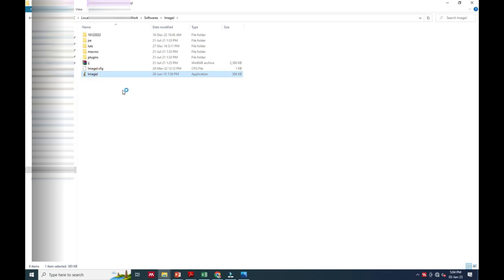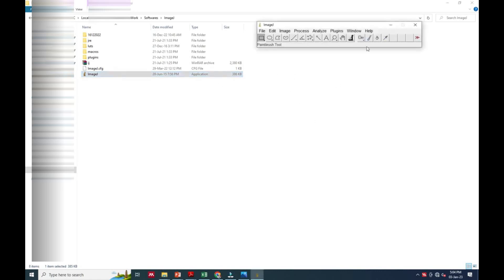It is very easy to install. You can get it from researchsop.com easily. It is available in the software section. So here we have the software ready.